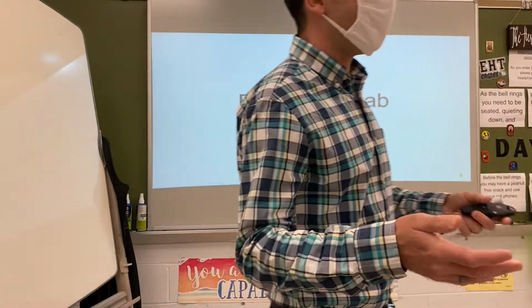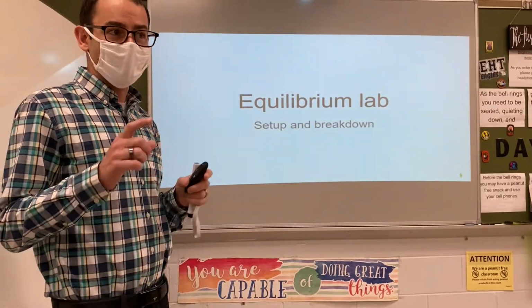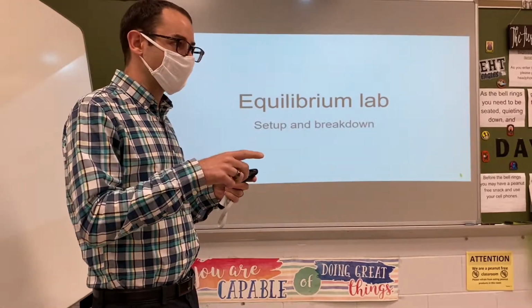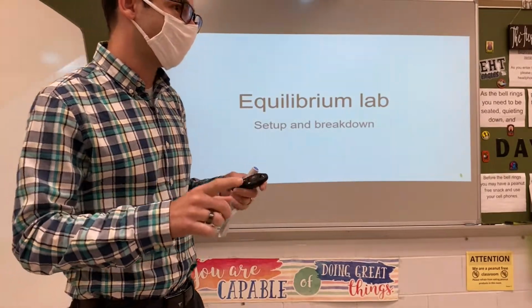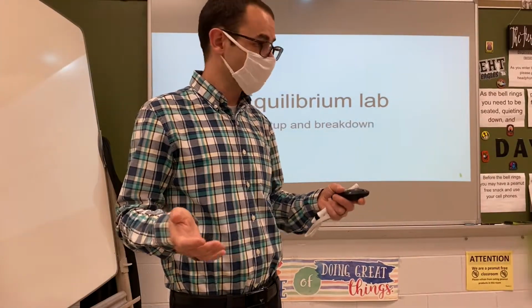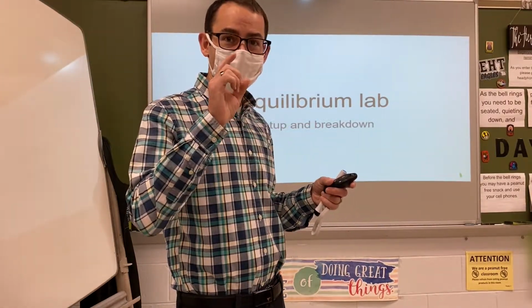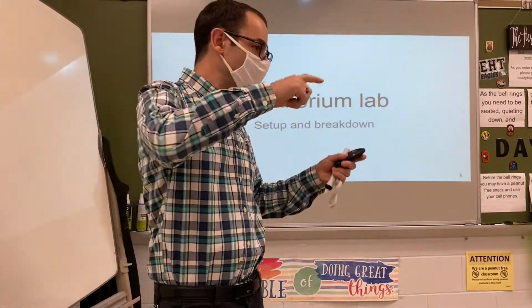All right, so today's lab is an equilibrium lab, which we haven't started the equilibrium chapter, but we've seen some equations that have to do with equilibrium. And as you guys read through this, we know we're dealing with hydrochloric acid, which we know is what kind of acid? Strong acid, right? It's a strong acid. And then acetic acid is a what kind of acid? Weak, yeah, it's not one of the 7 we memorized, right? So the weak acids have to have what kind of arrow? Double-headed, right? So equilibrium, the next chapter, is all about those kind of arrows.